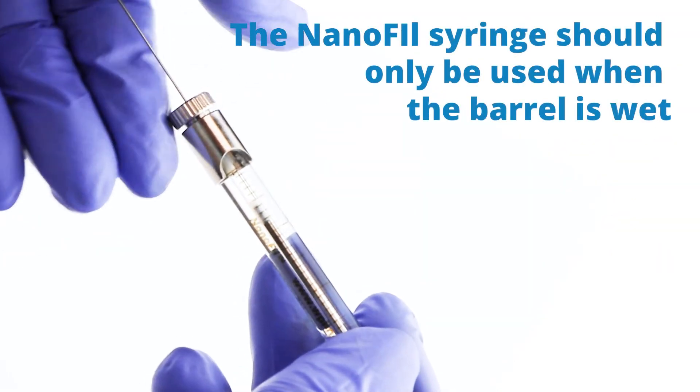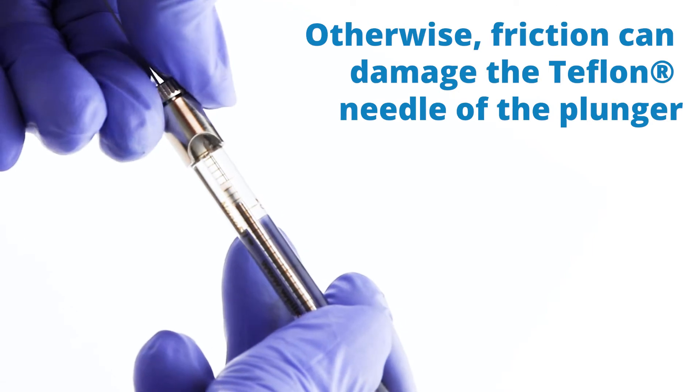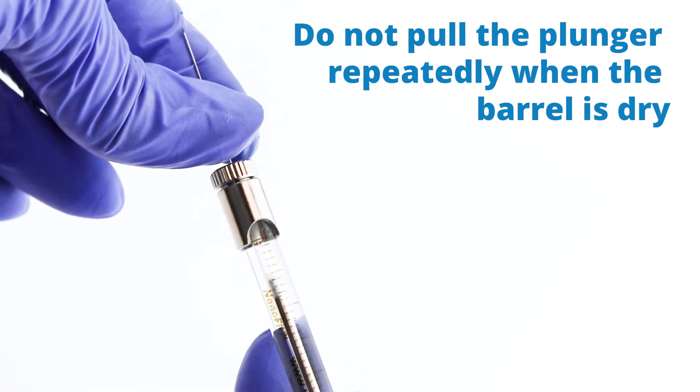The Nanofill syringe should only be used when the barrel is wet. Otherwise, friction can damage the Teflon tip of the plunger. Do not pull the plunger repeatedly when it's dry.